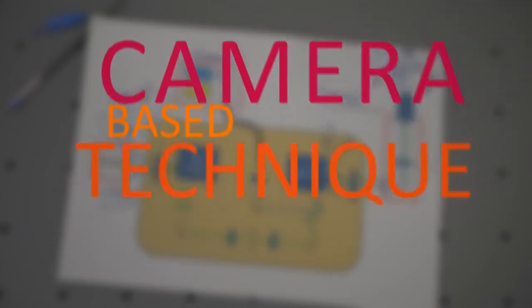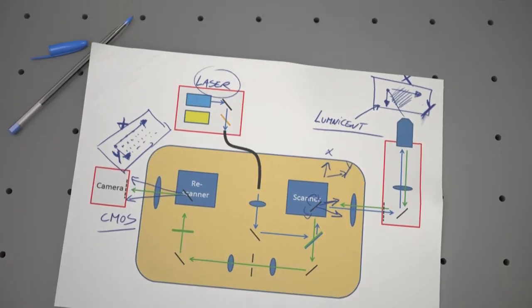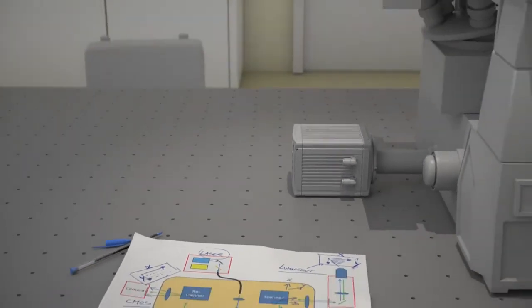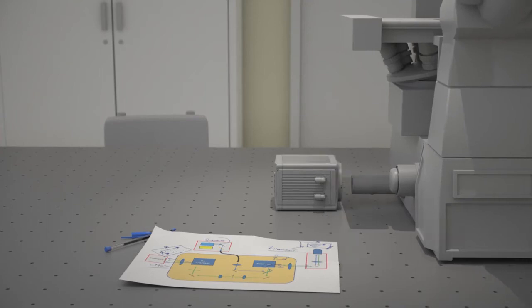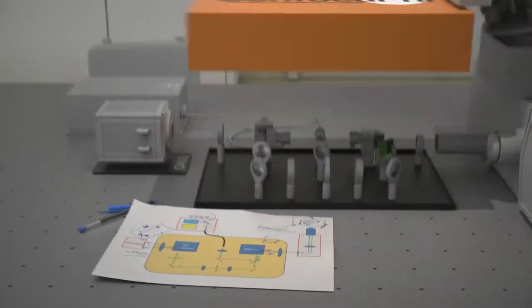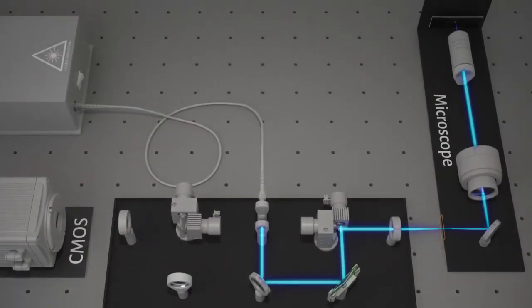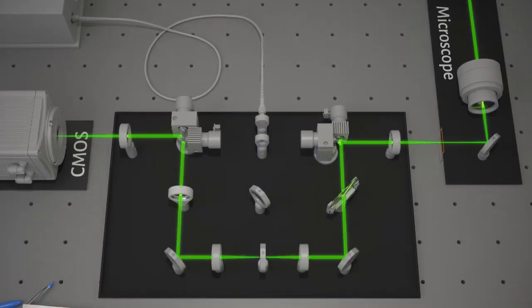A lower price. RCM is a camera-based technique without complicated electronics. This makes the RCM very affordable. The architecture of a RCM system is very simple, as it is connected with microscope and camera via a standard C-mount adapter. It is actually a box coupled in between your microscope and camera. The optics inside the box reads the object under the microscope and writes the information on the camera chip.